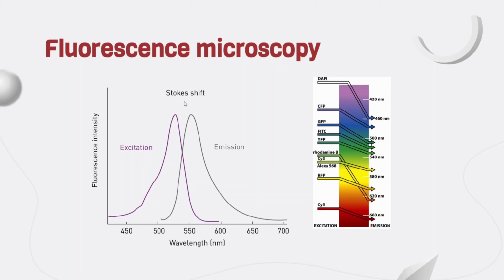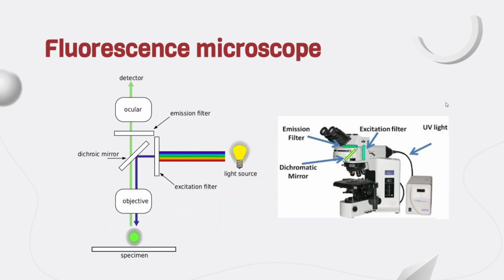In fluorescence microscopy, we use this principle with visible light, which ranges from about 400 to 700 nanometers. We use this to study structures at the microscopic level. The graph reported represents the wavelengths used in fluorescence microscopy to excite the sample, obtaining an emission of a certain color in the spectrum. A fluorescence microscope is an optical microscope that uses fluorescence instead of, or in addition to, reflection and absorption to generate an image and study properties of organic or inorganic substances.